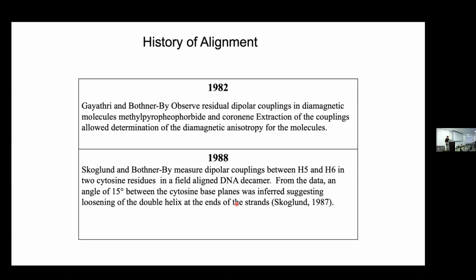Yes. What was the magnetic field strength? I think Art was asking that. It might have been 600. So you just took DNA in aqueous solution, put it inside a 600 and it aligned? Absolutely. That's one of the first things I did in New York City. Yes, we'll talk about that. Nucleic acids align by themselves. Yeah, all your paramagnetic proteins will align too, spontaneously.